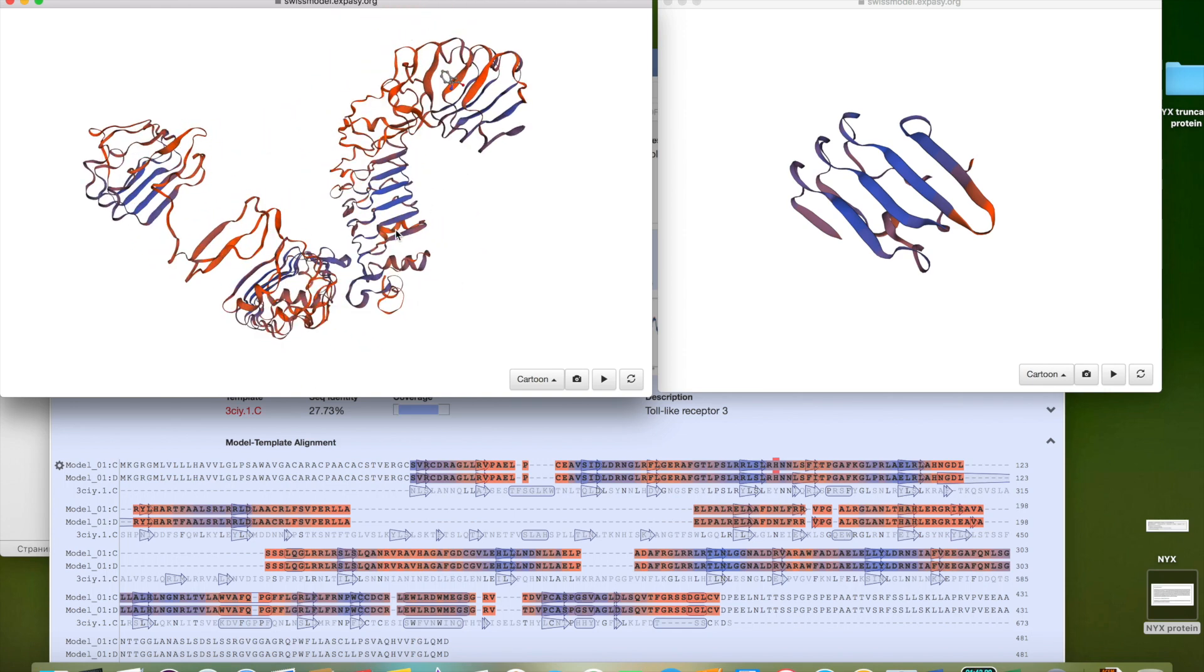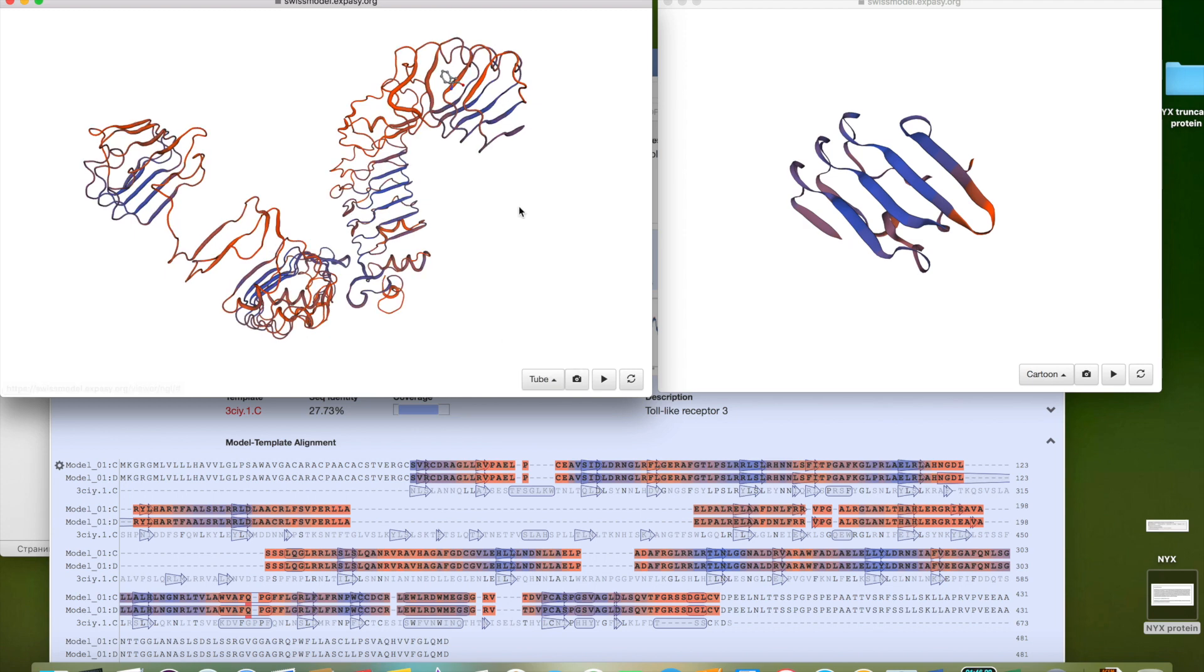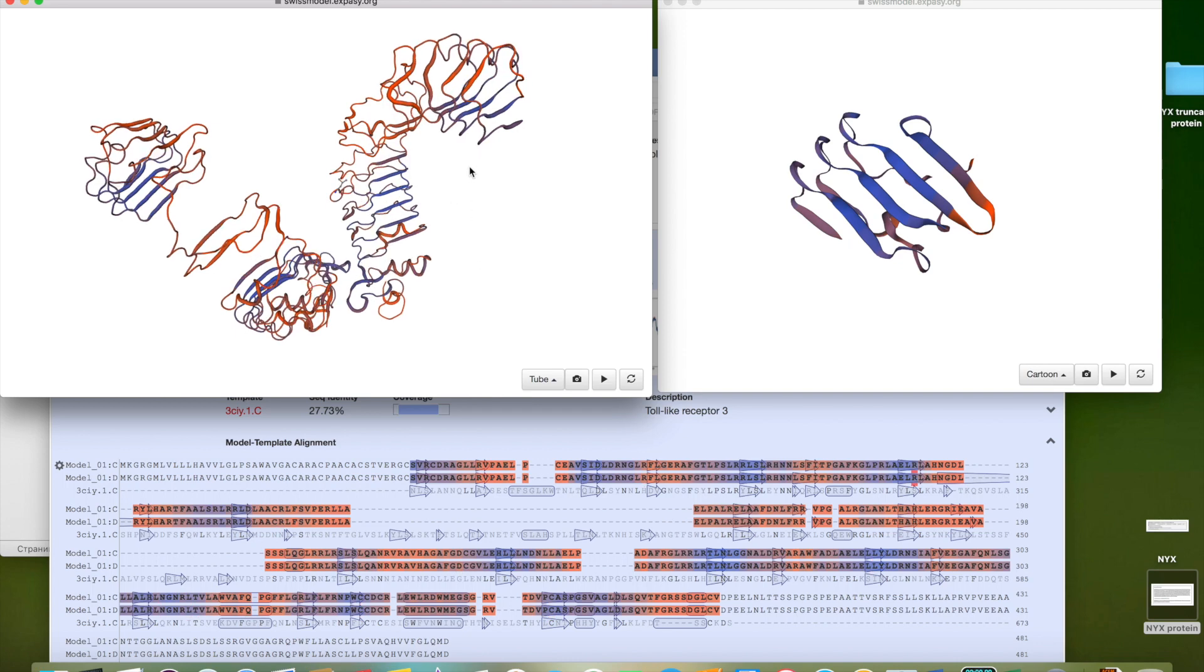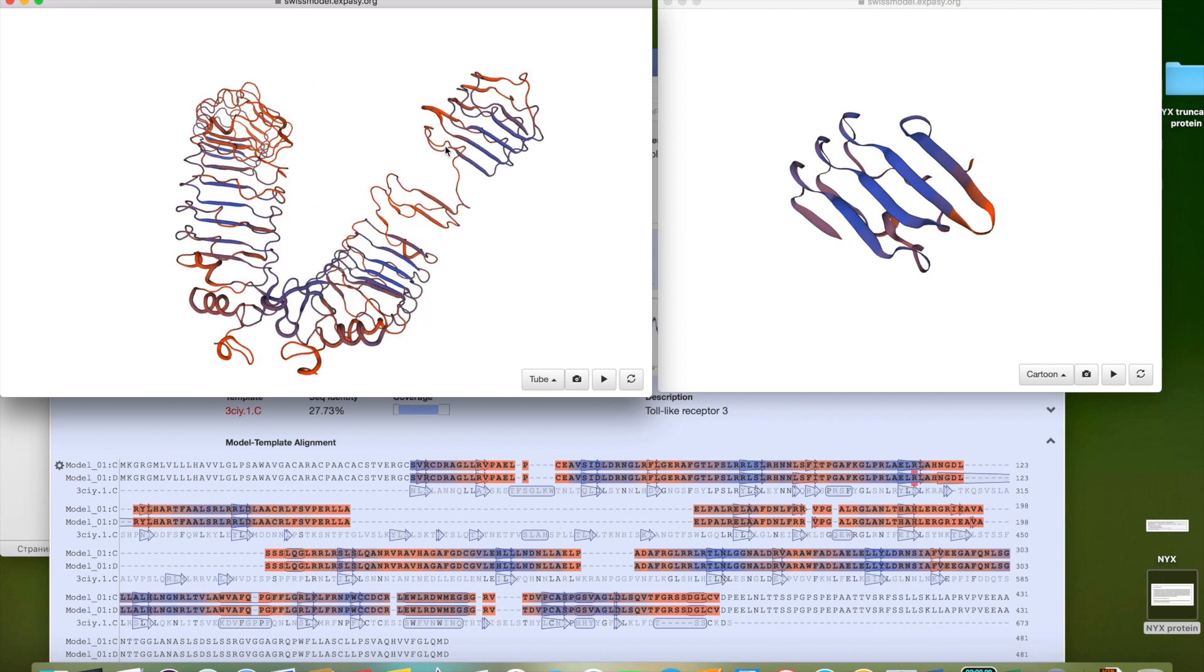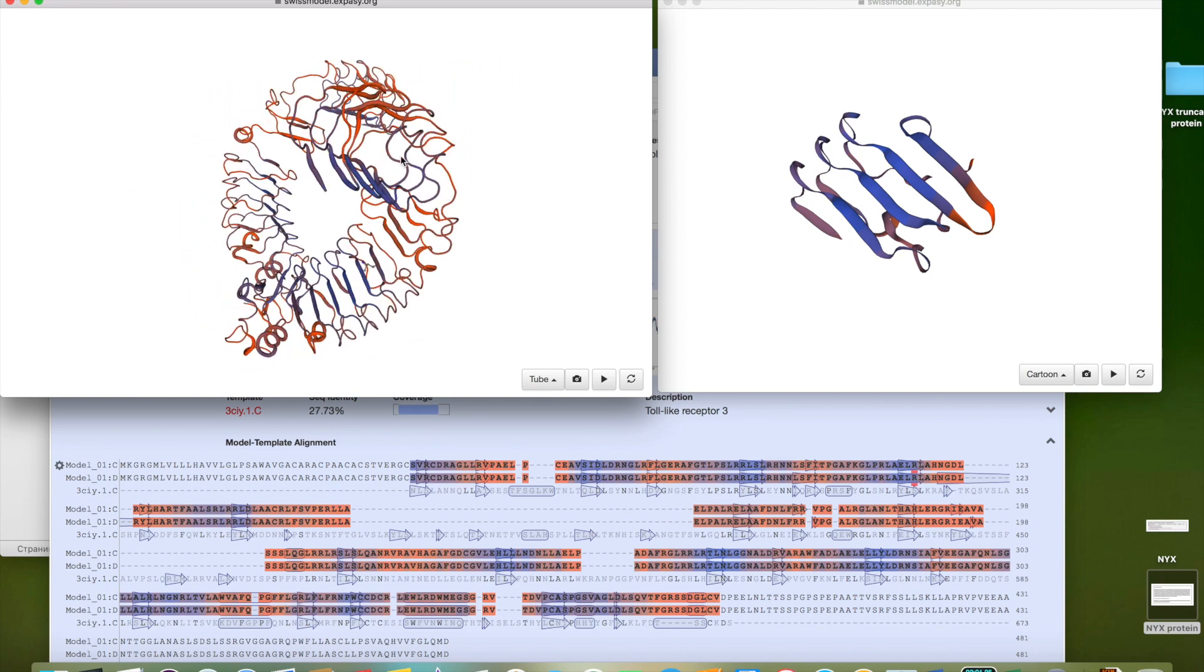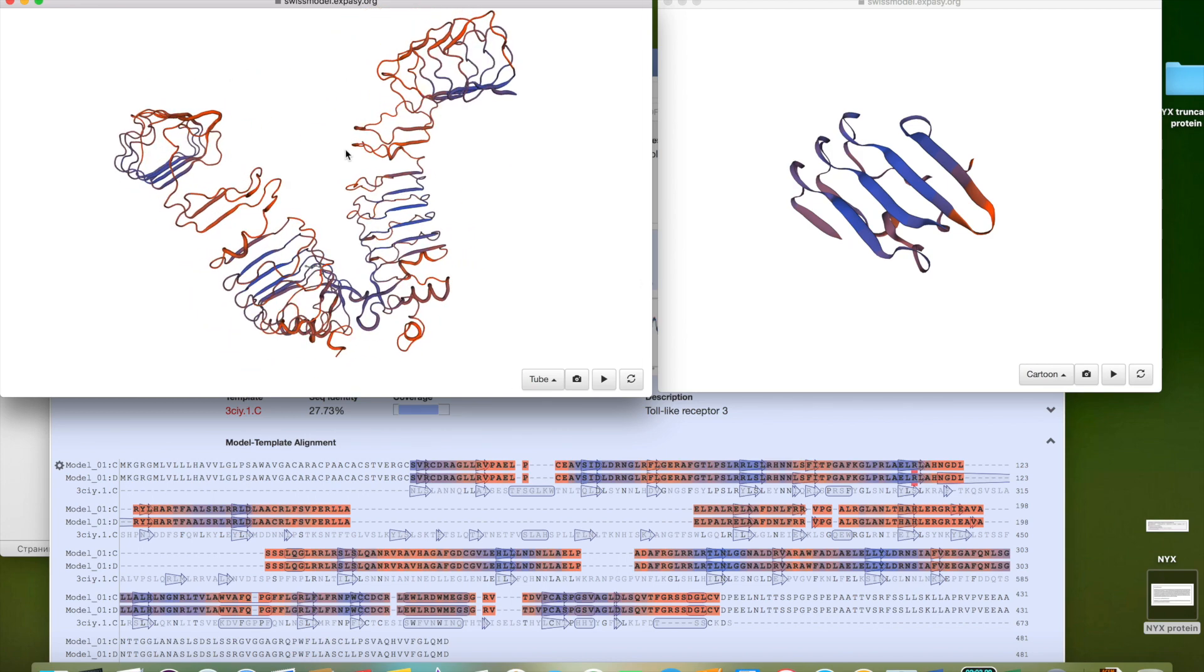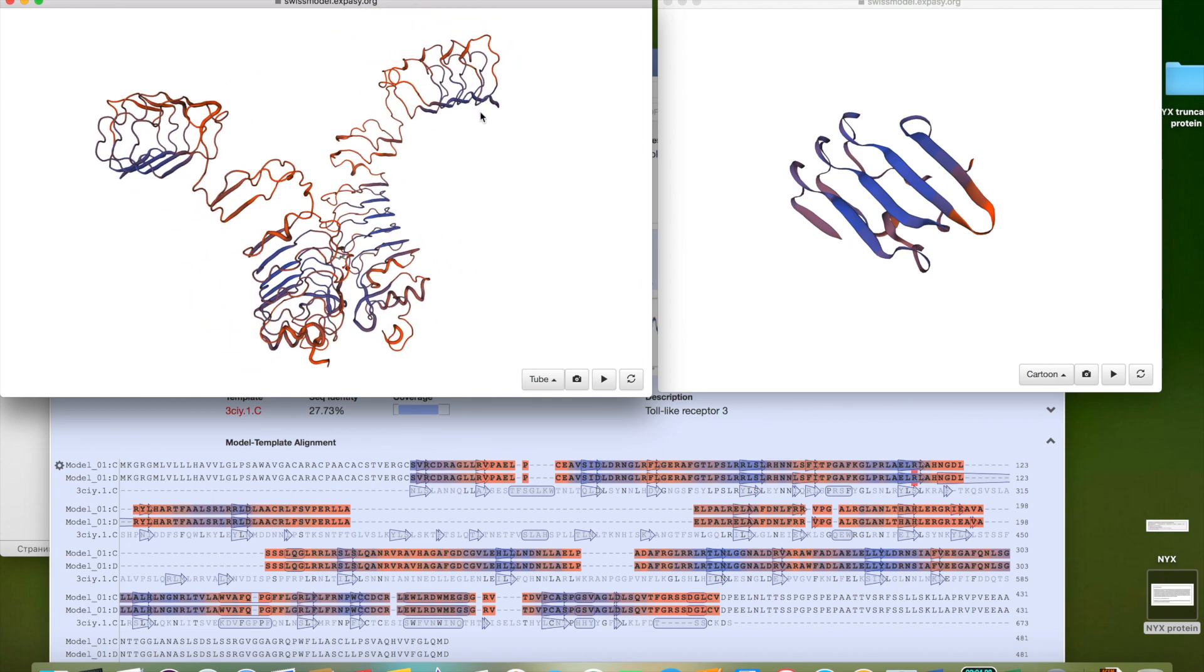We can see in the bottom part of the screen the exact location of the amino acid. So two heads or tails with histidine 95 loop.